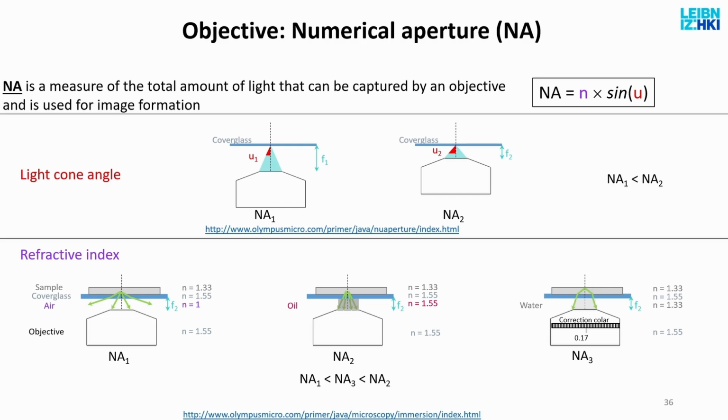There is also such a thing as water oil, which is a Zeiss invention, which has the refractive index of water but the consistency of oil, which means that it doesn't evaporate so quickly. But it also means that when you are done using, for example, an oil lens, you have to clean it. Because if, let's say, you do the experiment and go away for a summer holiday for 3 weeks, the oil will solidify and regular agents will not remove it, so you have to send it to a specialist.